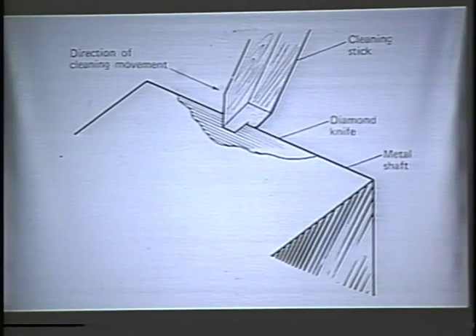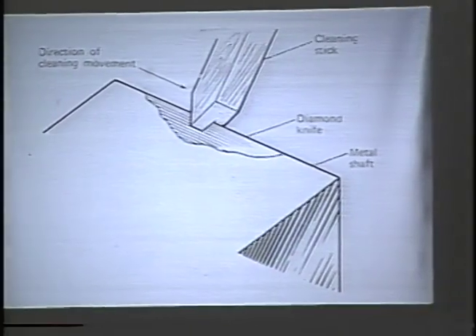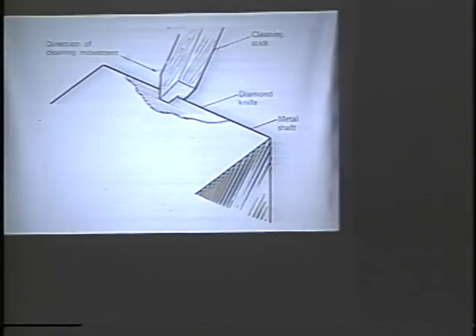So that's very strong. And the way Sid had demonstrated that was moving a block over the diamond edge so that it was going to be a section several millimeters thick. So the block was over the knife edge, and then they tapped the block, and this big chunk of embedment fell off.